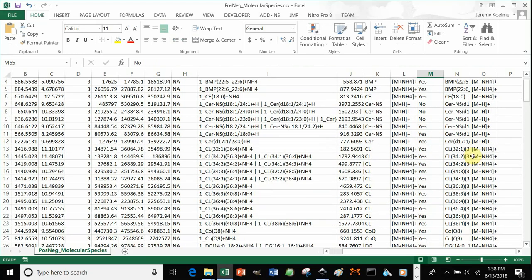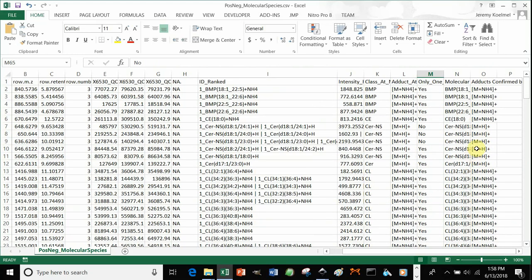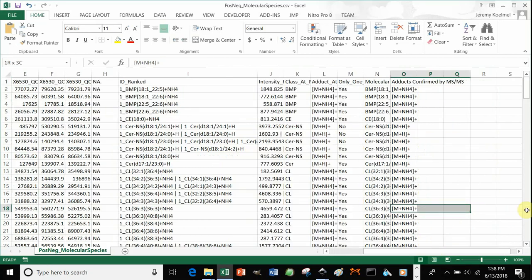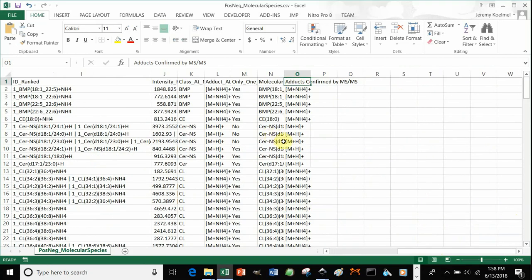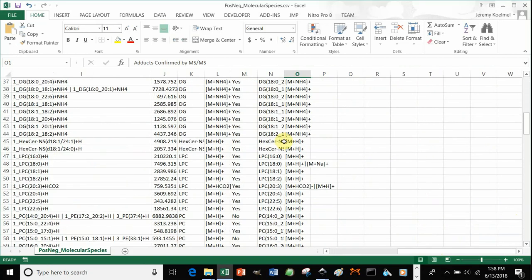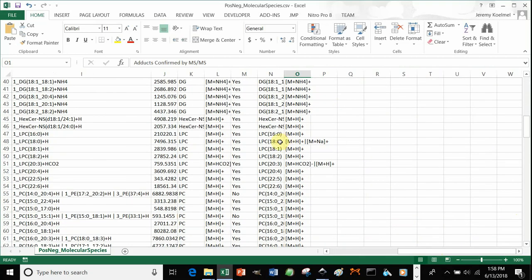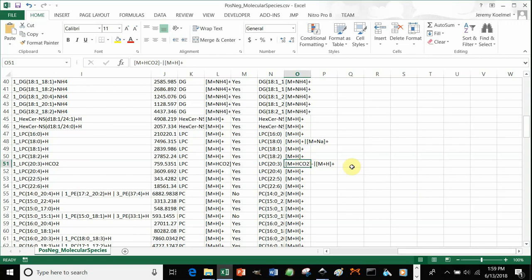Also, when we combine adducts, sometimes you get multiple adduct confirmations for a certain feature, and that gives you added confidence. For example, in this case with LPC 18-0, we saw both a protonated and sodium adduct. And 20-3, we see both a formate and protonated adduct identified.